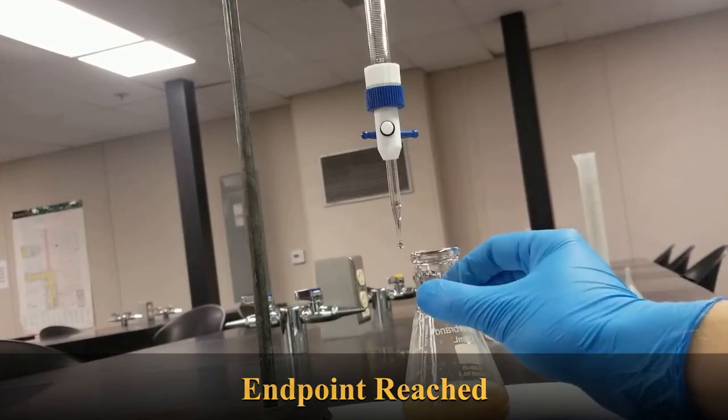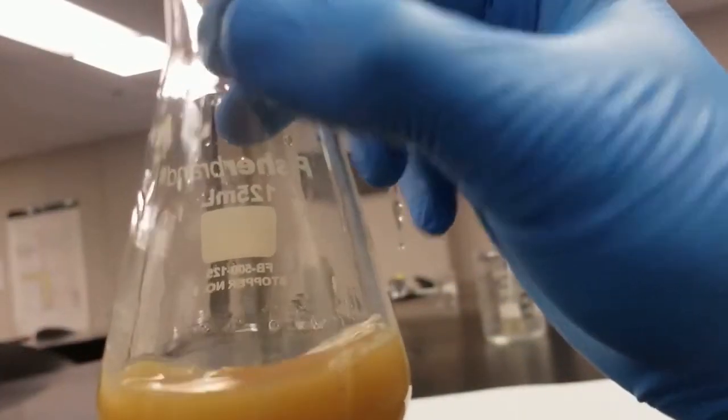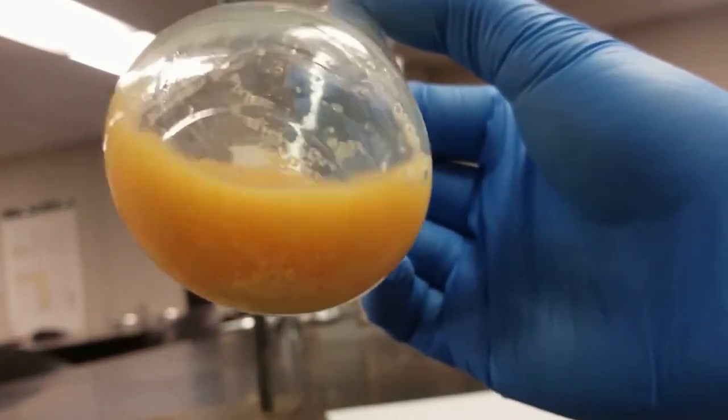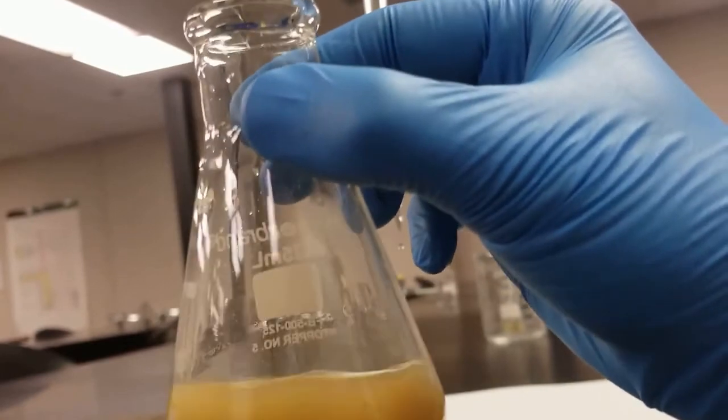As you can see at this point, my solution has turned into this kind of reddish brown instead. You can see the white silver chloride in the bottom, and then there's a reddish brown to it. So we're either right at the endpoint.